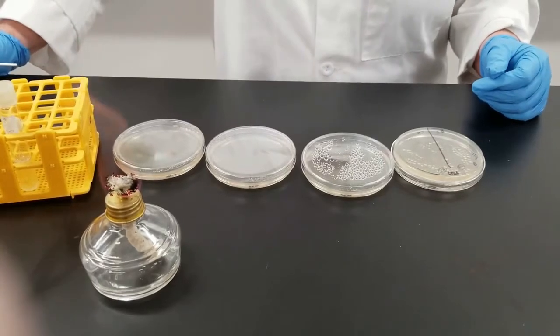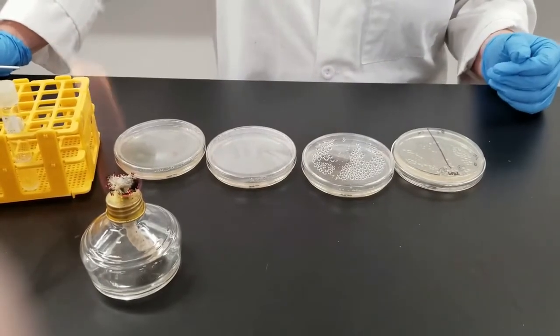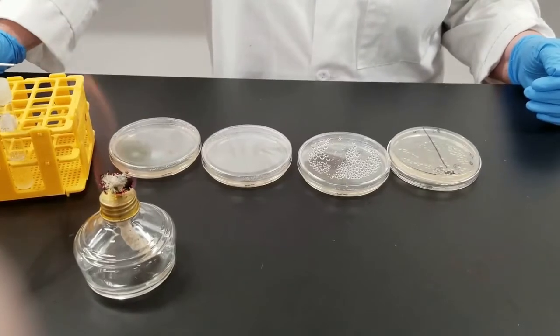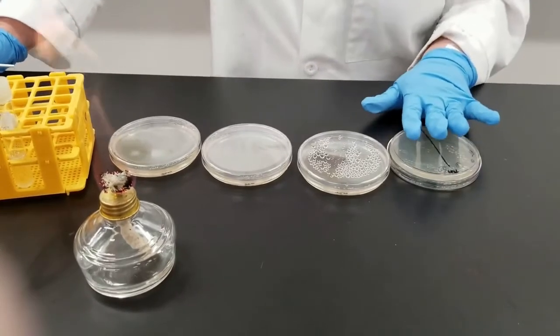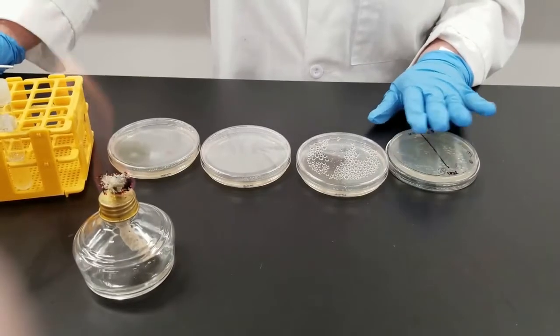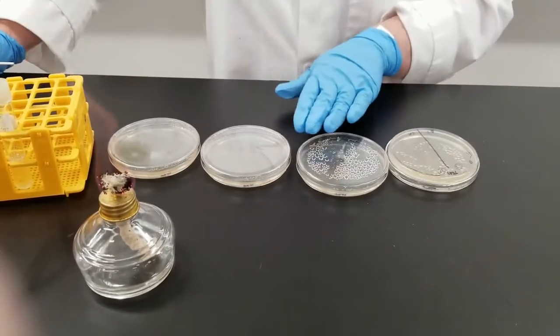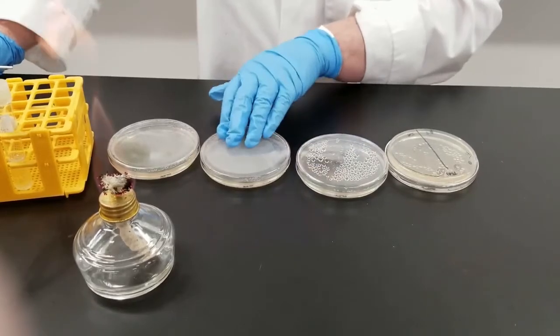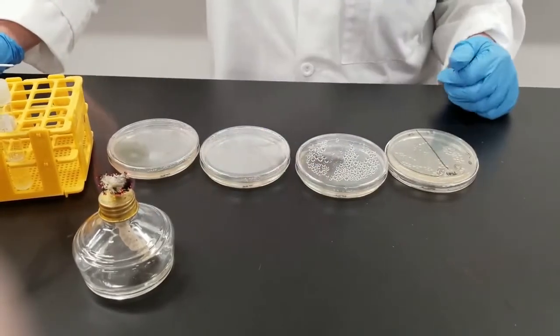We're going to inoculate the plates and then expose them to UV light. So we're going to have an initial plate which will be no exposure. Then we have one plate that will be exposed for 5 minutes to the UV light, 10 minutes under UV light, and 30 minutes under UV light.